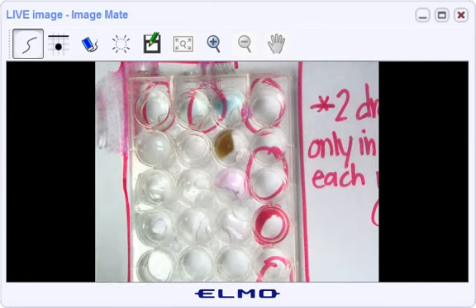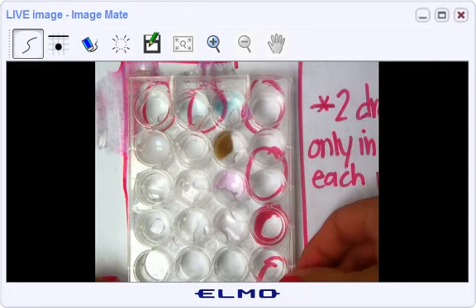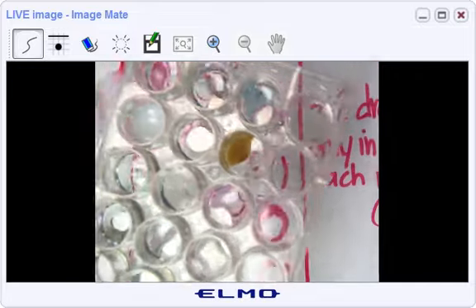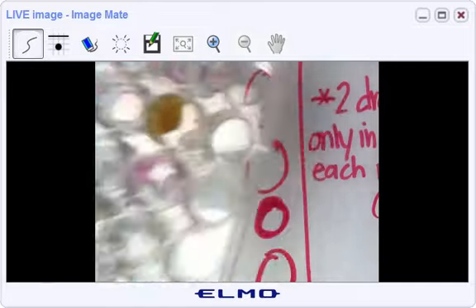If it turns pink, that is not a precipitate. What's the same with them? Just ignore it. I shouldn't be seeing a black strap across your face.